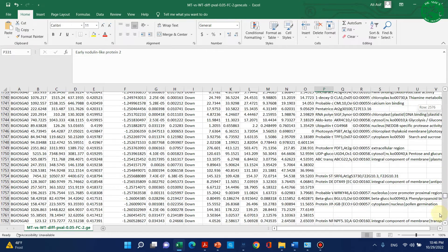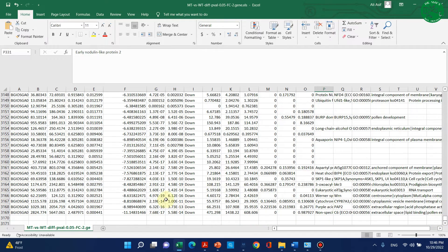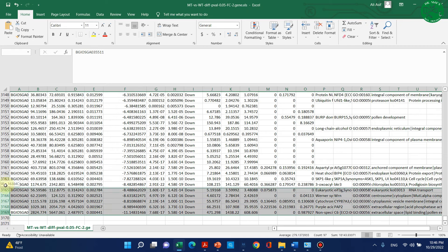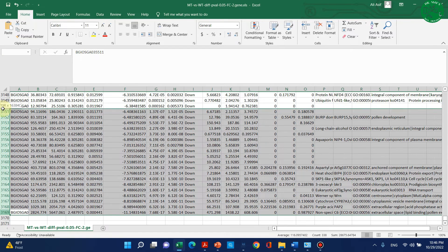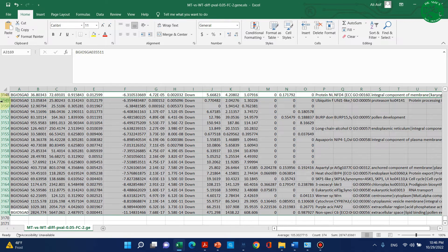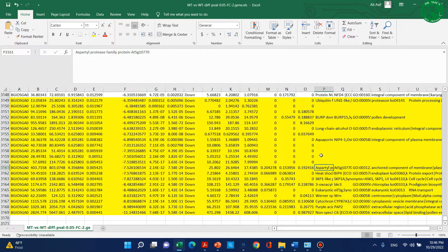Similarly, we can go to the end of the list and select down-regulated DEGs. Column F was showing the FC value. We can select 10 or 20 genes — let's suppose 10. Using their annotation data, out of all 10 we can select any 5 or even 10 for qPCR validation. This is the first way to select our genes for qPCR analysis.